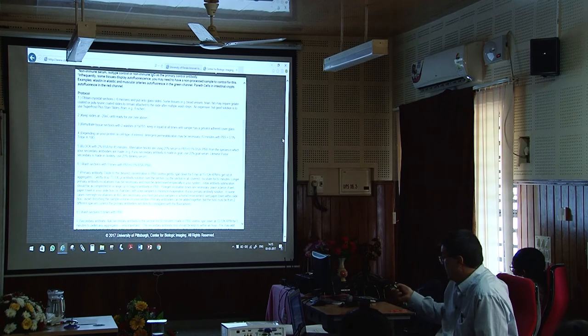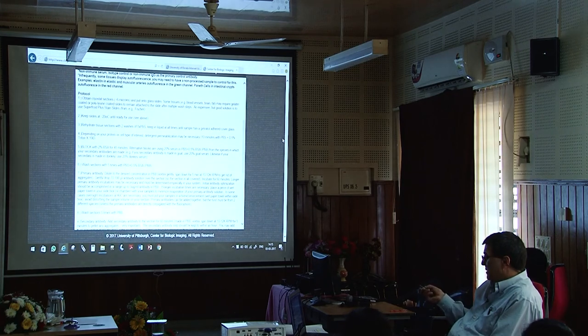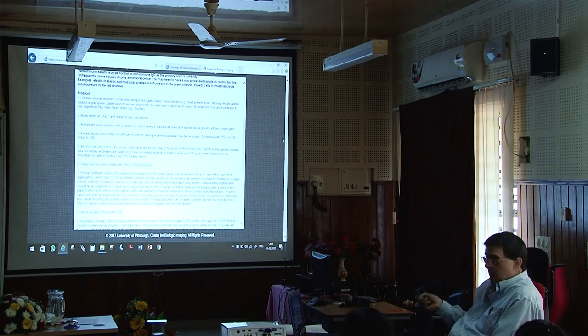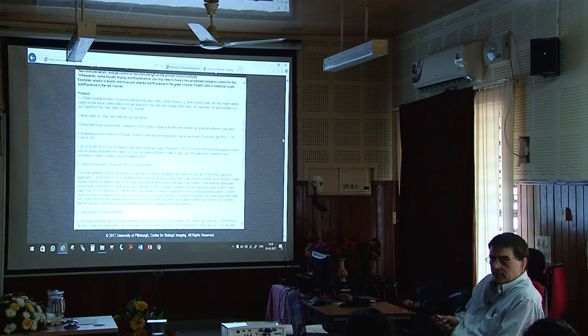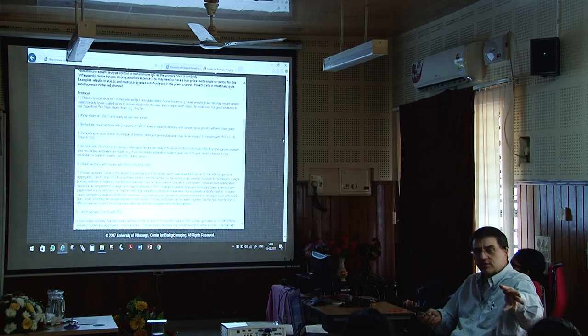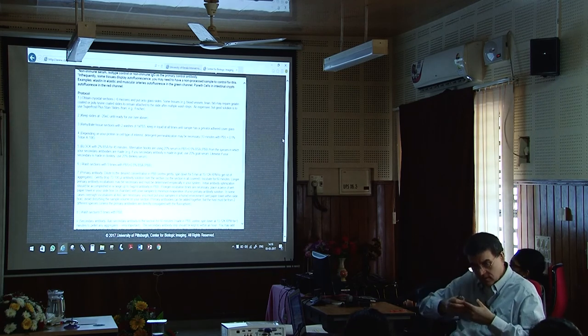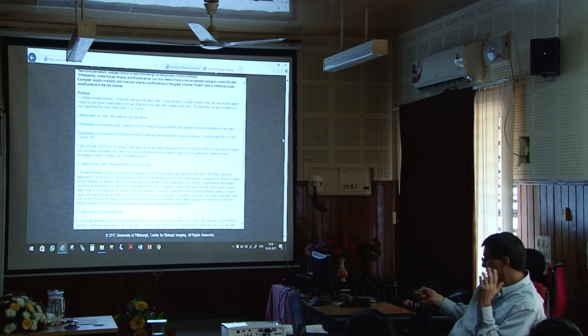Okay, so when you start doing your staining, again, it all comes back to wet. You can rehydrate your tissue sections with PBS. Just a word aside, I don't know how you make your PBS, but if your PBS is made wrong, then you're not isotonic. It's a nightmare. It will cause problem after problem after problem. I had a lab for a long time. I couldn't figure out what was going on, and it was the PBS was way off, and the cells were just shrinking up, okay? Because you remember that was probably in general biology, osmosis, water will follow the salt. So if the isotonicity is wrong, it'll shrink or swell. So it's real important to make sure that's isotonic.